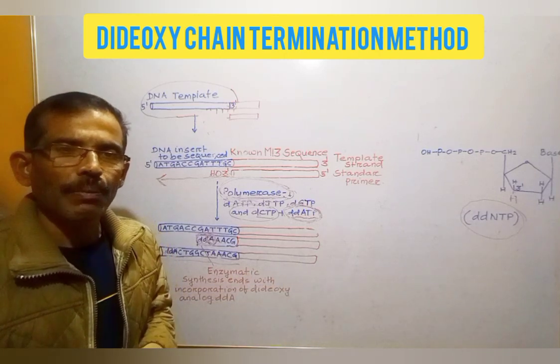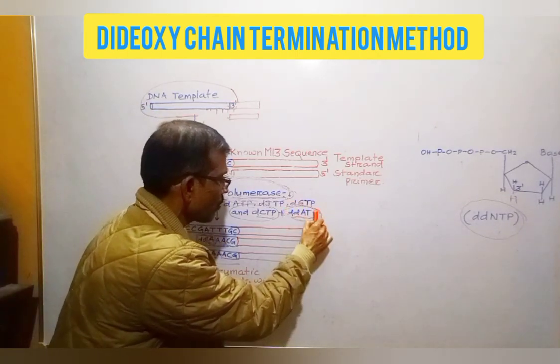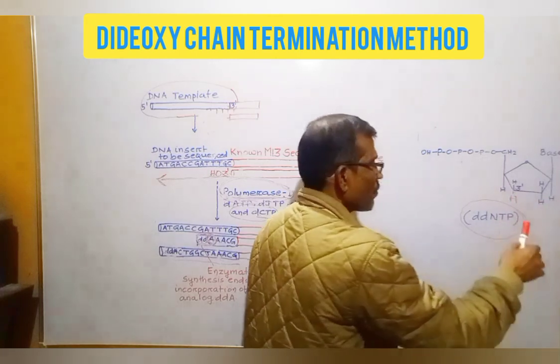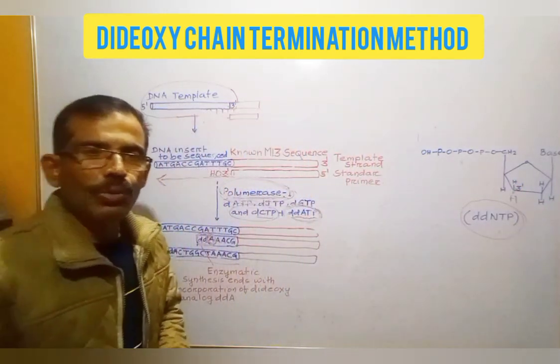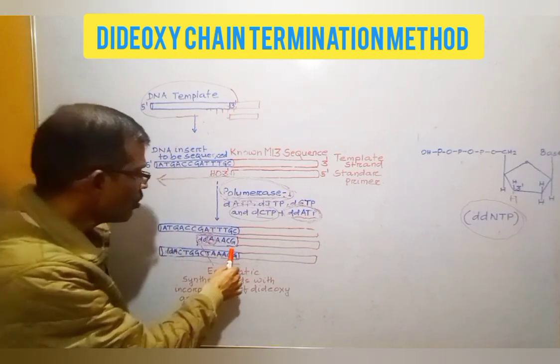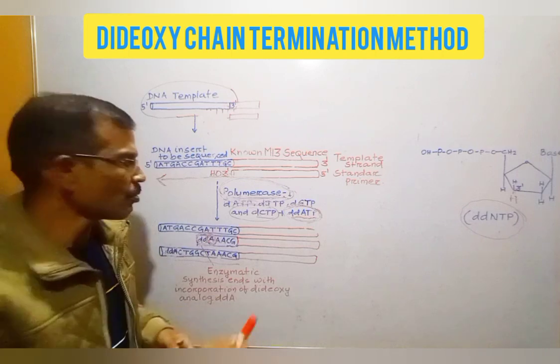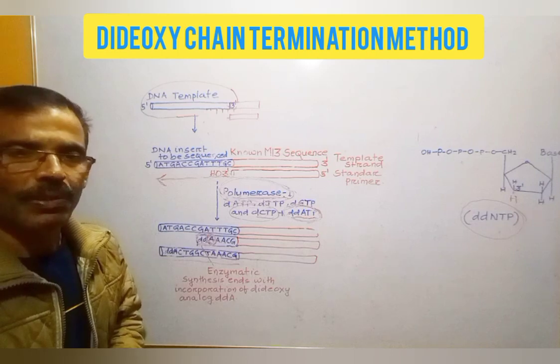DNA replication can be interrupted by including dideoxynucleoside triphosphate in the reaction mixture. Dideoxynucleoside triphosphates do not have a hydroxyl group on the third carbon. It is due to the absence of the hydroxyl group on the third carbon that, during the process of replication, when a dideoxynucleoside triphosphate is added to the growing DNA strand, DNA replication is interrupted.